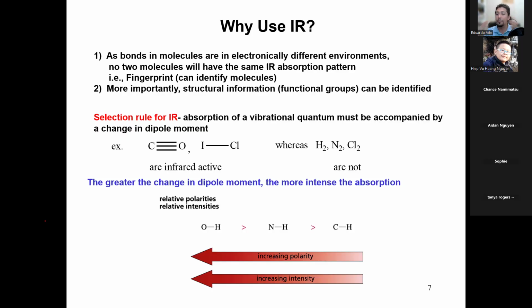There has to be a polarity difference, like carbon-oxygen, carbon-nitrogen, oxygen-hydrogen, fluorine-hydrogen. Hopefully it makes sense. We call those heteronuclear bonds. Heteronuclear bonds are polar bonds, and polar bonds have a change when you put them into a spring, right? You're changing the size of the dipole if you bring them closer or further apart. So you have to have a change in the dipole in a heteronuclear bond in order to have an IR signal. But that's only the first condition.